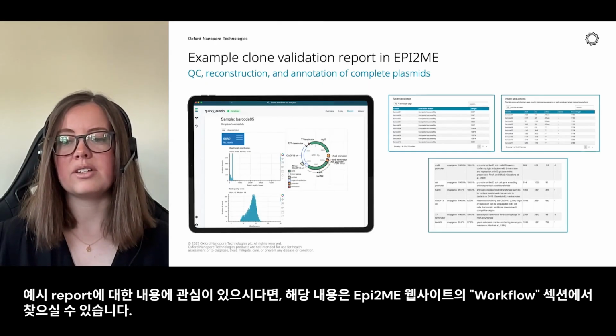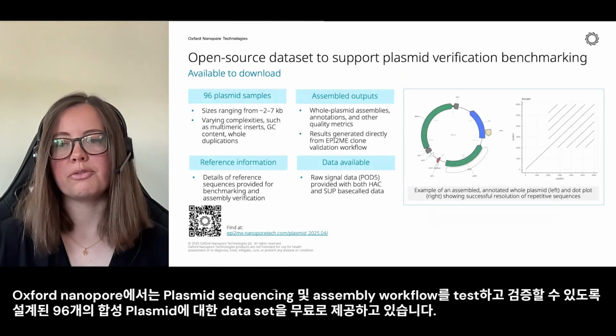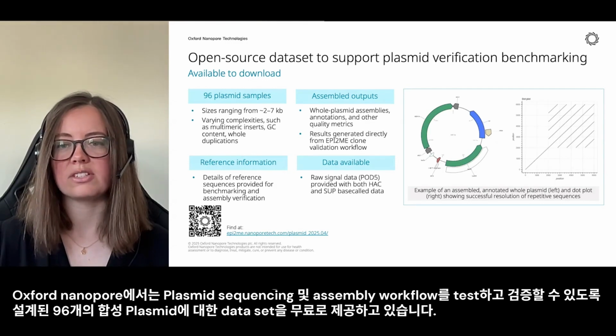If you're interested, an example report can be found in the workflow section of the website. Oxford Nanopore has released a freely available dataset from 96 synthetic plasmids designed to test and validate plasmid sequencing and assembly workflows using the method we have discussed today.